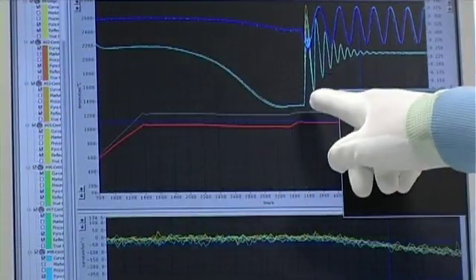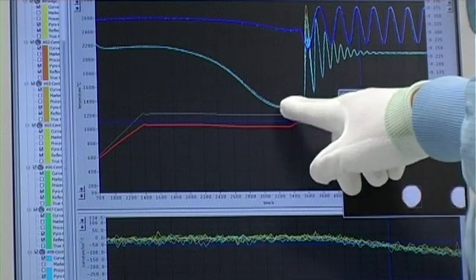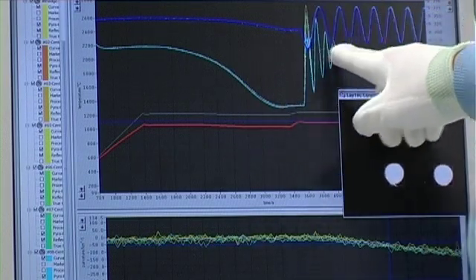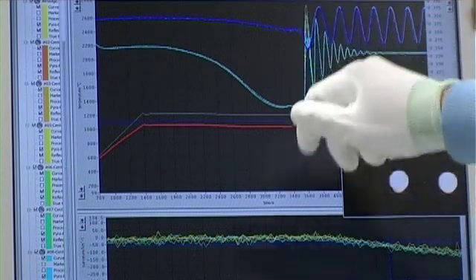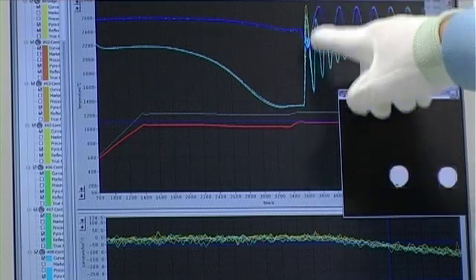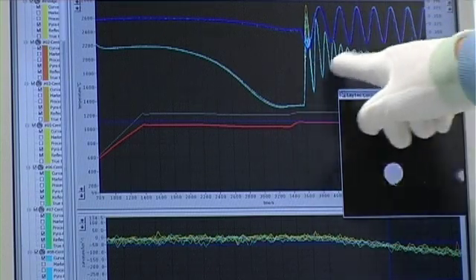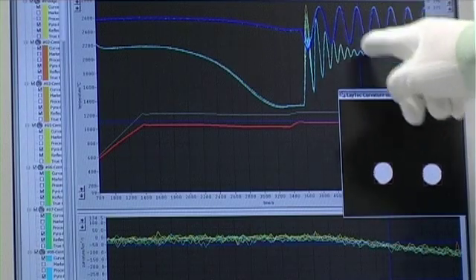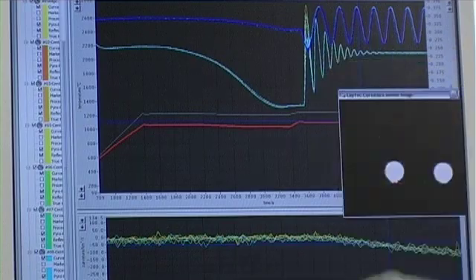This is the reflectance at 400 nanometers. Here we see change in material, this is aluminum nitride, and this changes to gallium nitride. And you see the reflectance responds immediately to the change of material. And you see, of course, the oscillations, which give us information about the growth rate. And you see that the oscillation damps out. That is because at this wavelength, the gallium nitride is already absorbing at some thickness.